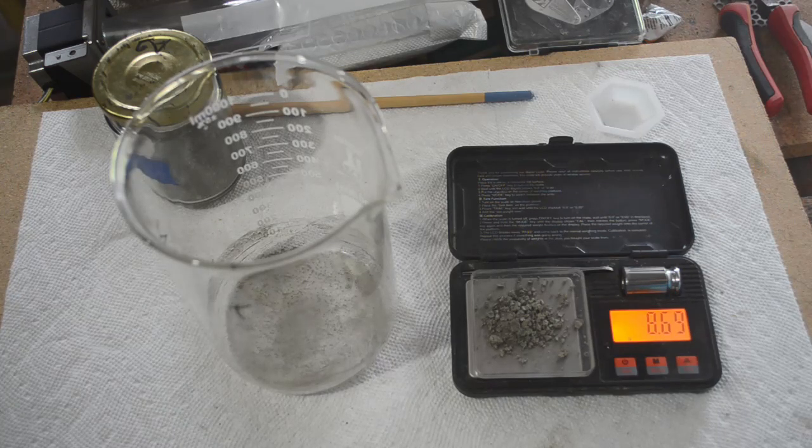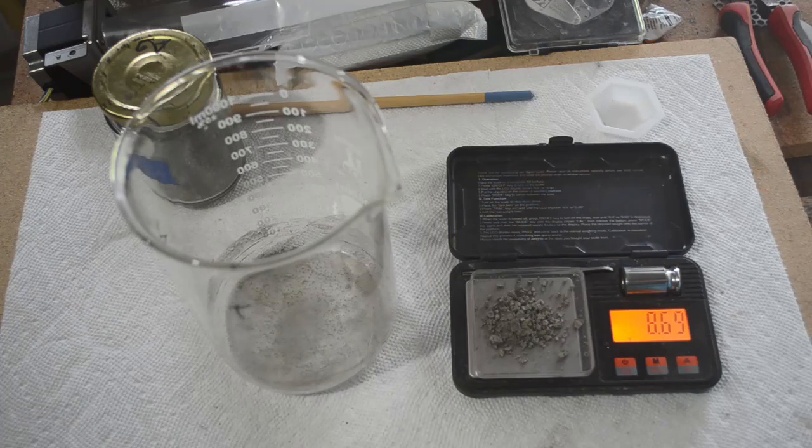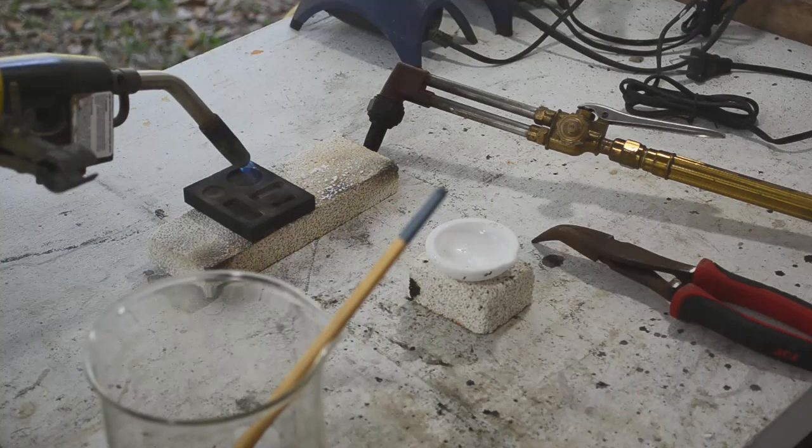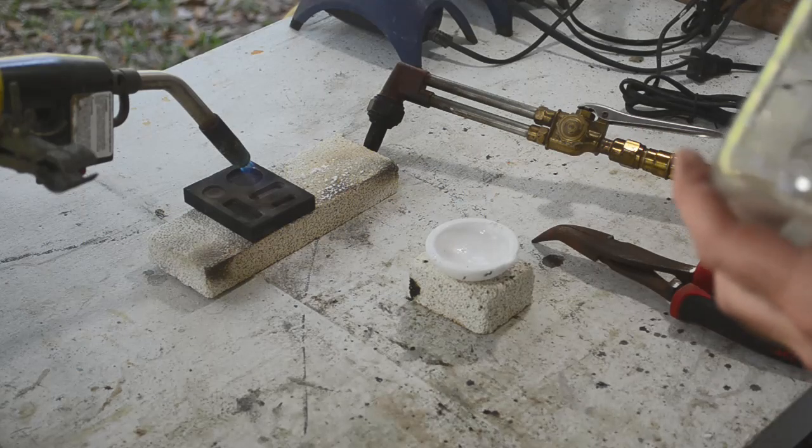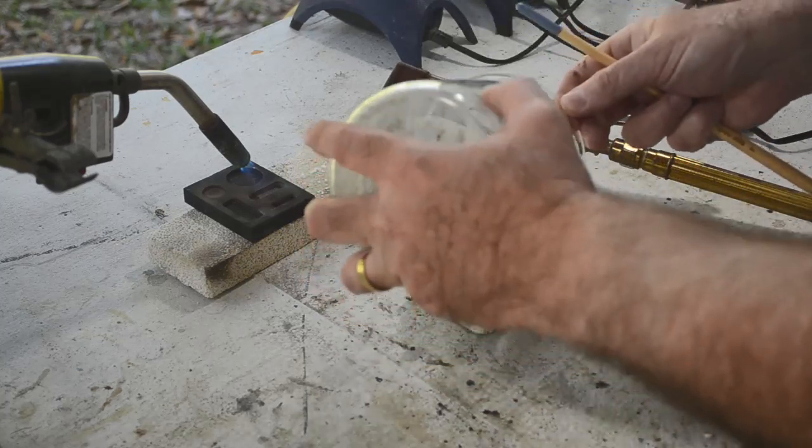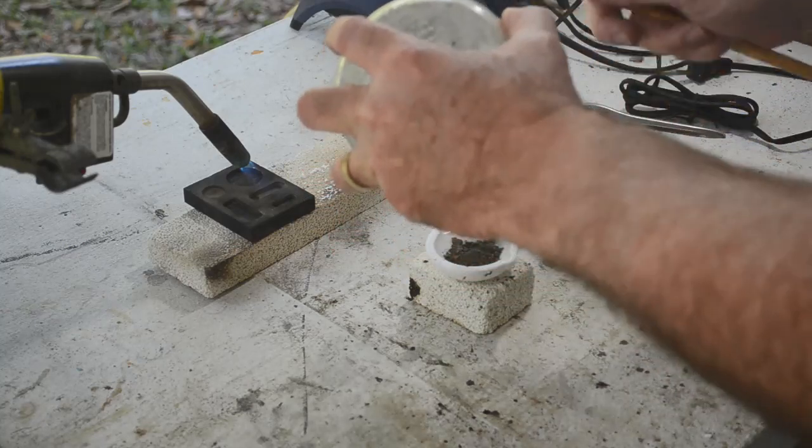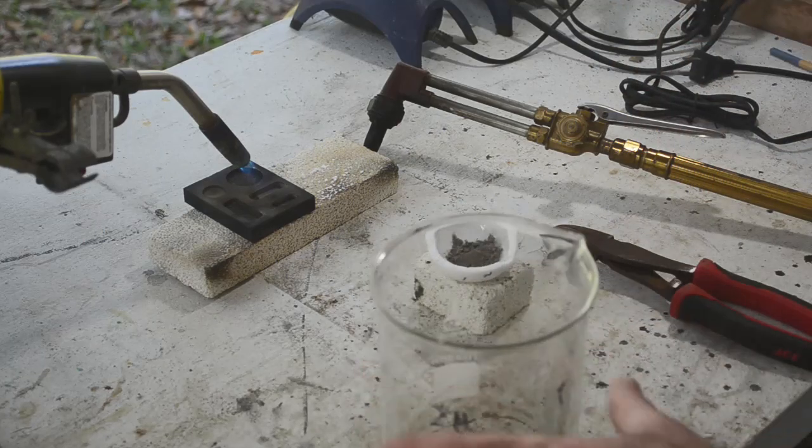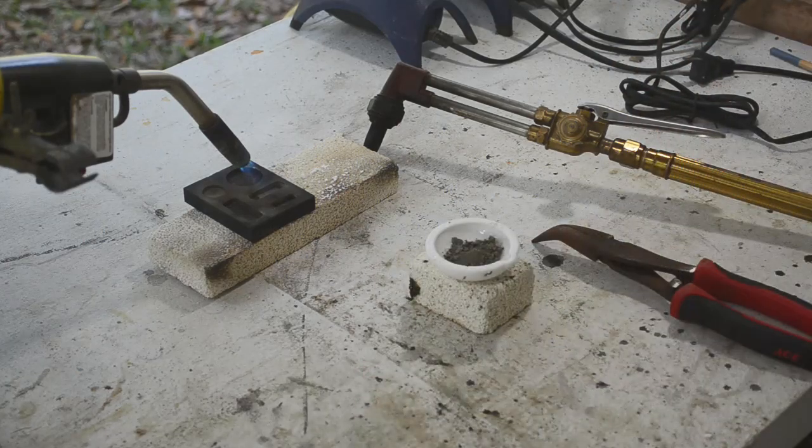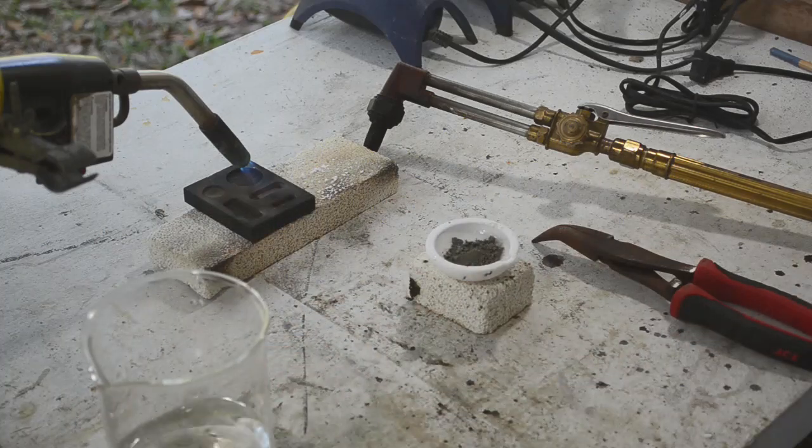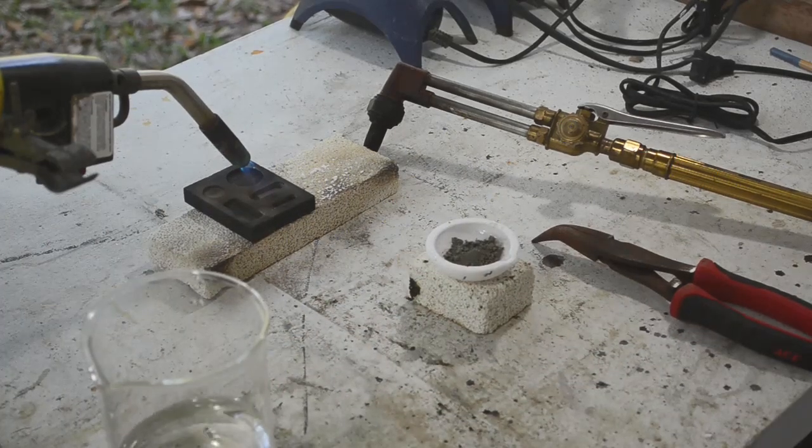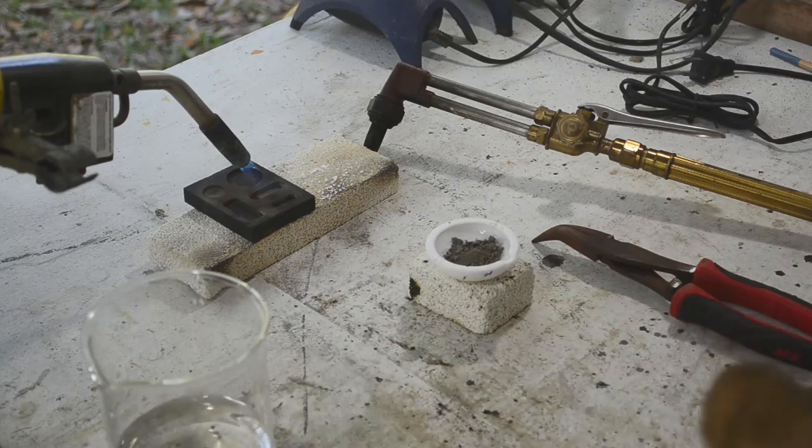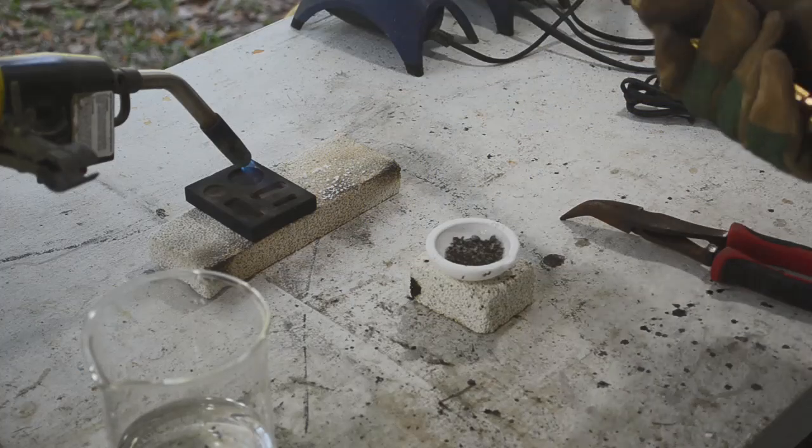Hey, what do you say we melt this down and see what kind of a button we're going to get out of it using this method. See if it's a nice button or not. Alrighty, let's try melting down this silver. Got a well-glazed crucible here. Some water to quench the thing in afterwards. And let me get my gloves on so I don't burn myself. Let me get the torch lit here.